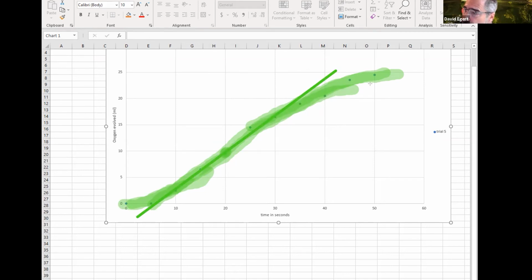But it kind of helps me to draw this big thing in to get a sense of, oh yeah, up in this part, I'm kind of making it harder. Up here, it's clear it's already starting to poop out and no longer be at its main slope. So as you look at the dots, you don't want to connect them, but you do want to try to intuit what is the true graph that these dots represent, given that there's messiness in how the dots are actually being measured, right?